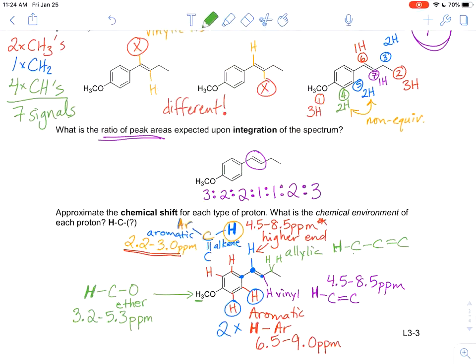That's where you'd expect it to show up. So you can see a real big proximity effect. If that hydrogen is right next to that alkene, it is way more de-shielded. Electrons are being pulled away, and it's kind of more naked and less protected from the magnetic field. Whereas in the allylic position, much less de-shielding is going on. So we see a much lower chemical shift.